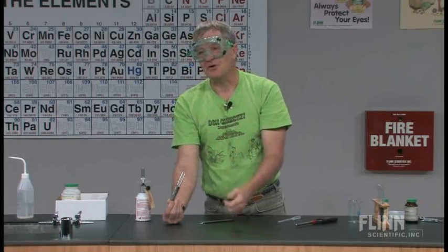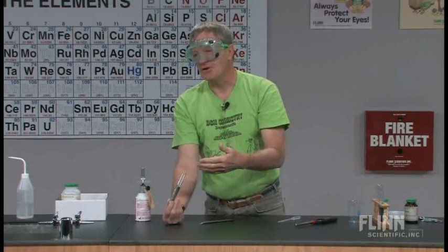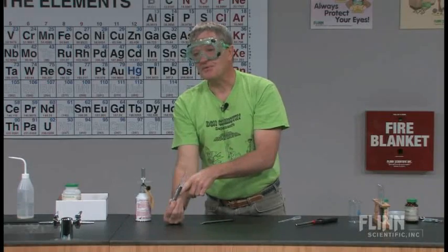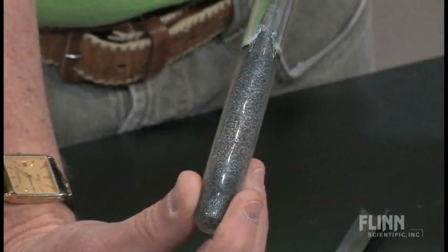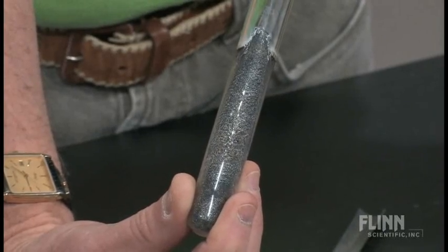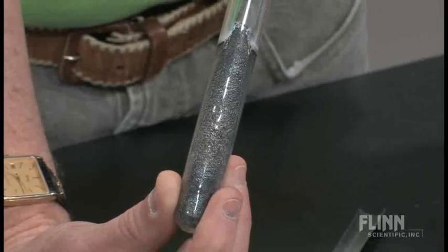And I know when I first started teaching, I used to say, you gotta get that cleaned out, kids. Come on, get it out of there. 15 years later, first time I did this reaction and started thinking about what was going on, I thought, that black coating that doesn't come out of there, what the heck is that? It's silicon. Because there's a silicon glaze on the inside of the crucible.